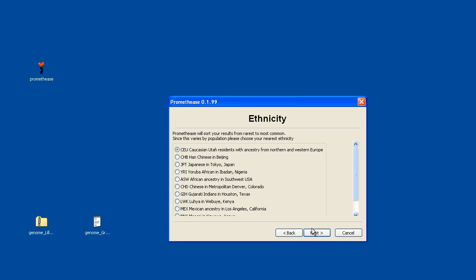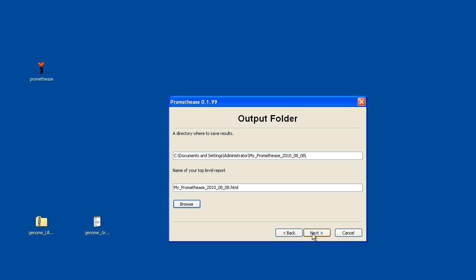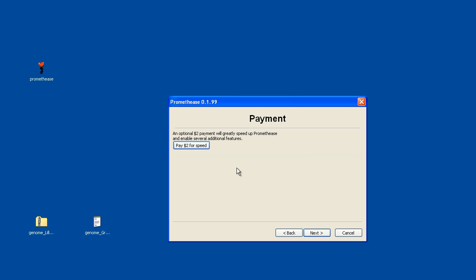We advance and choose an ethnicity. I'll stick with Caucasian here. Decide where to store your results and what name to give the main file that's produced. A number of other image files will be produced at the same time, so they all end up in that directory.